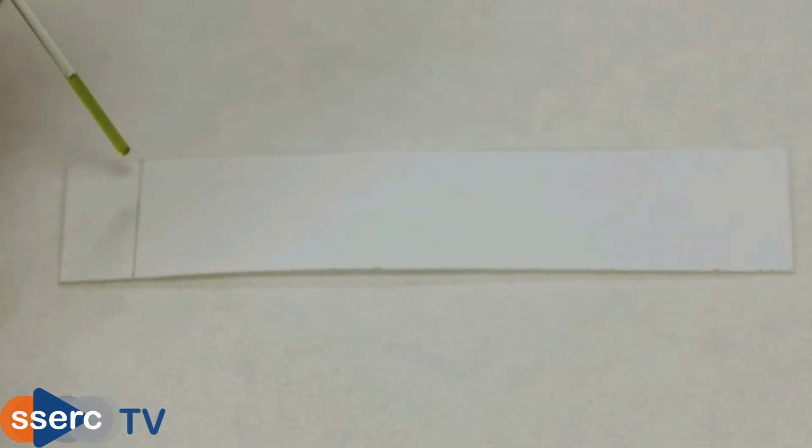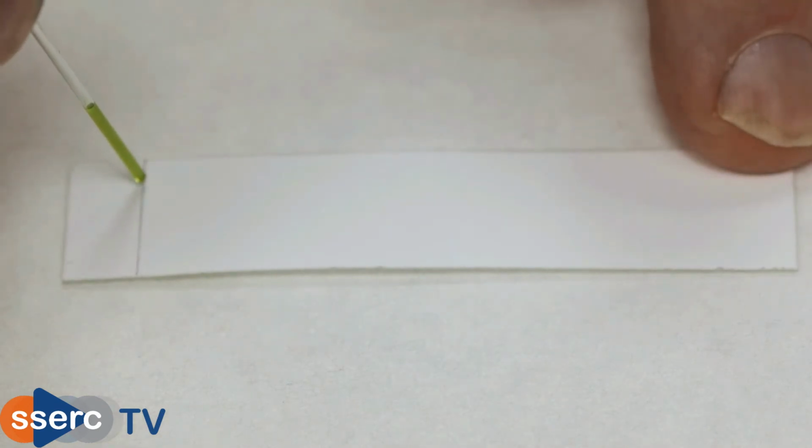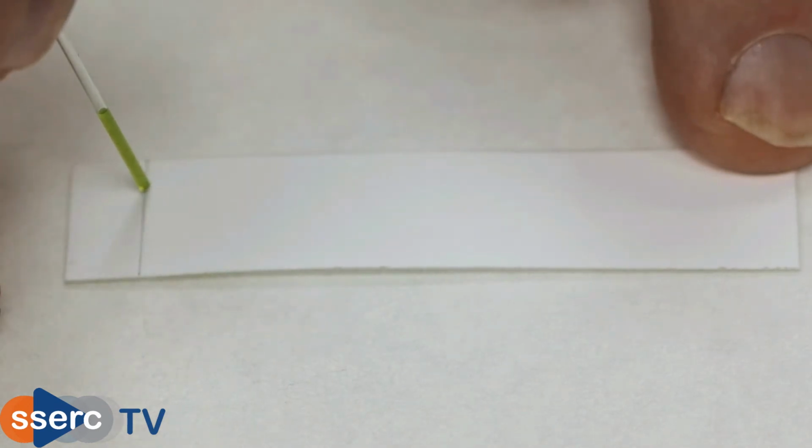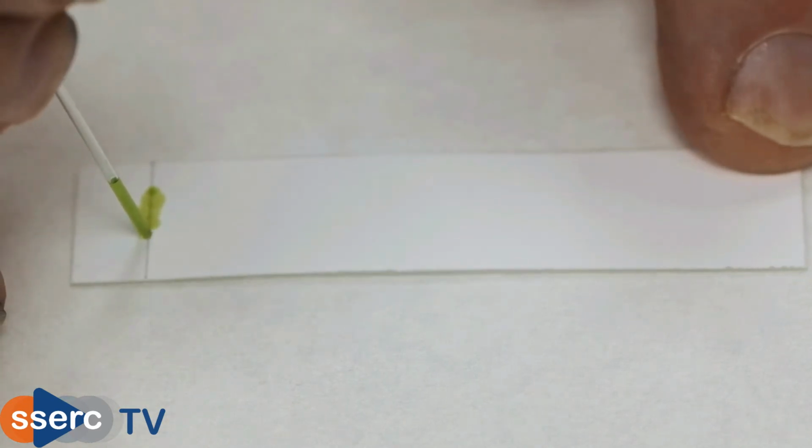To add your sample, dip a capillary tube into the extract and apply a small blob, or a row of them as in this case, along the line. If the colour is still faint, you can let it dry and then apply further drops on top, but I think this one's okay.